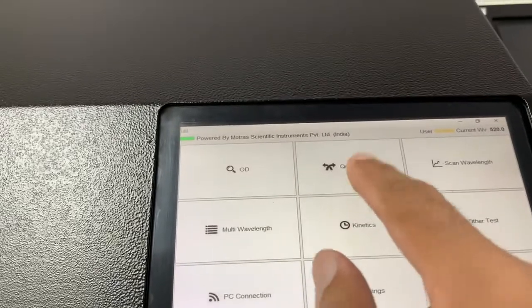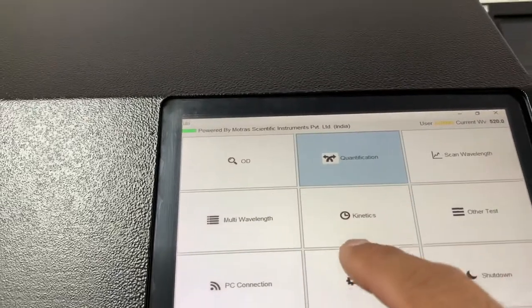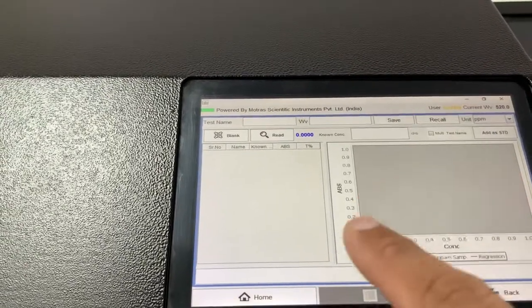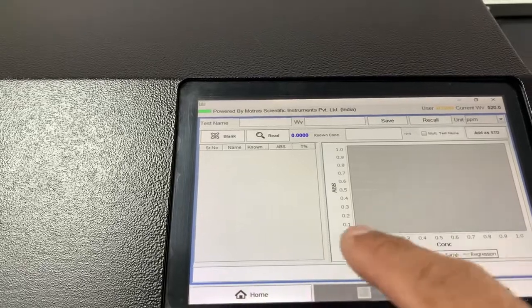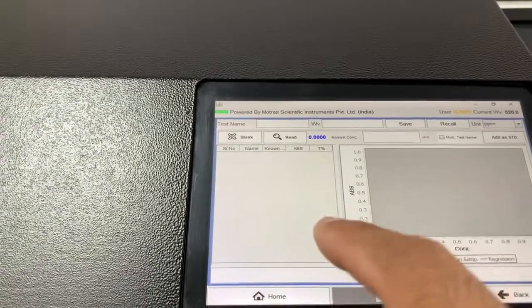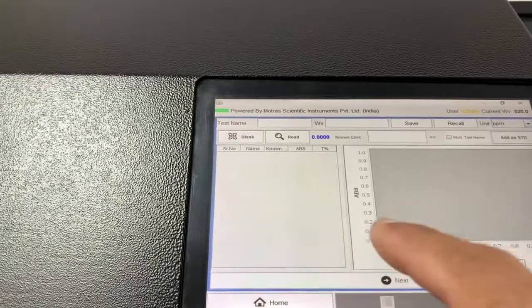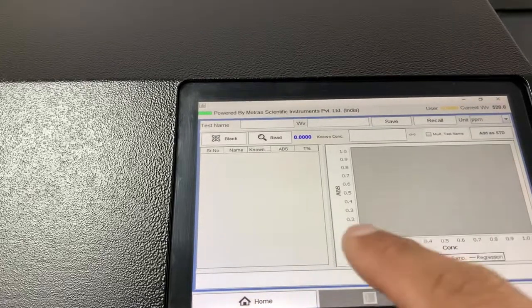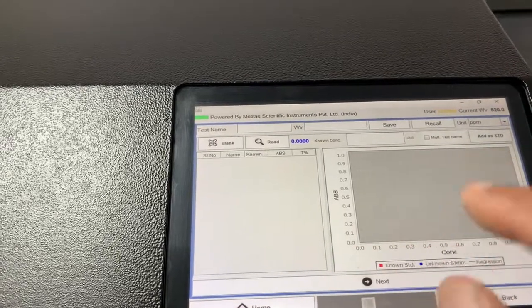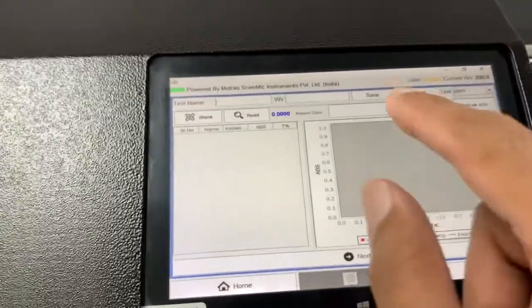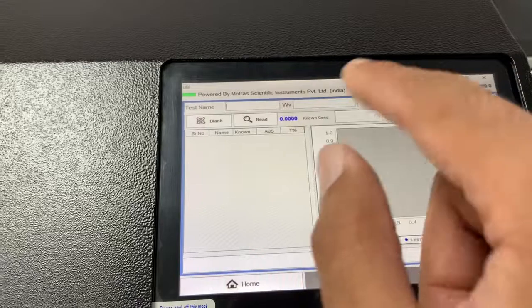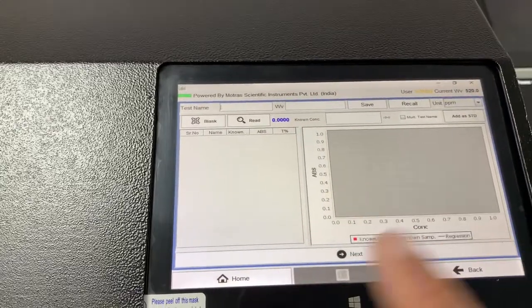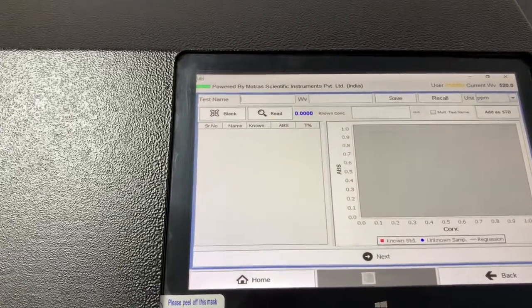We have quantification mode. We can create a graph and the system will automatically compute the unknown by plotting the points on the graph. You can save and recall previous graphs as well, and directly run samples on them.